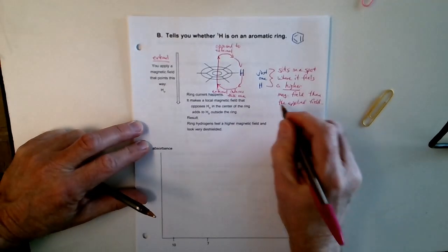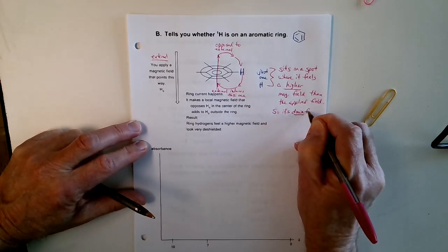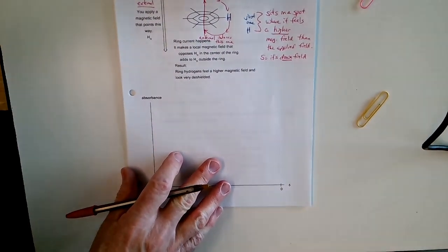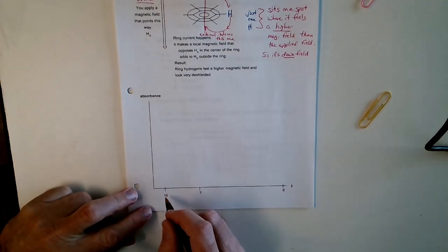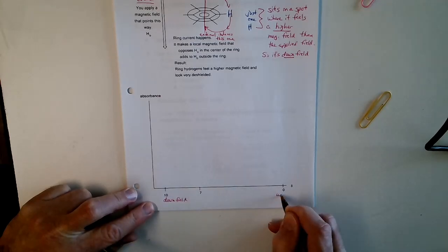Okay? So that means it's now going to be definitely downfield. And here's just a quick little opportunity to refer that term to the spectrum itself. Remember, downfield means left. Upfield means right.